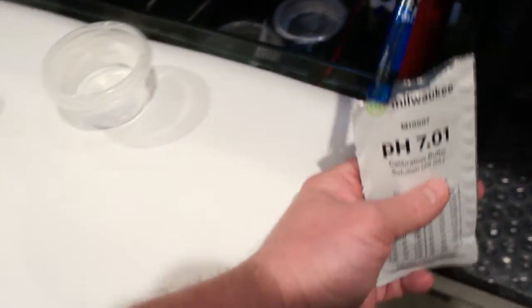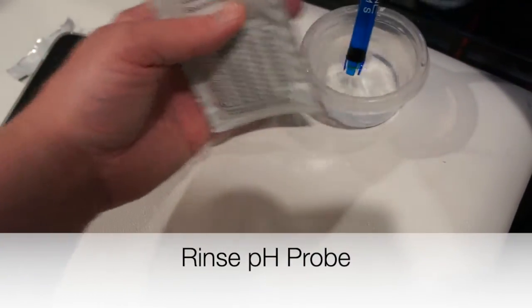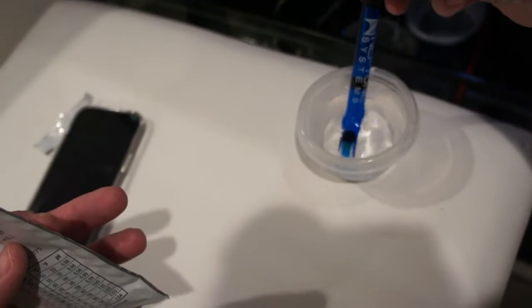Next, gently take the pH probe out and dip it in that little cup of RODI water to clean it off, then get ready for your upper range calibration.